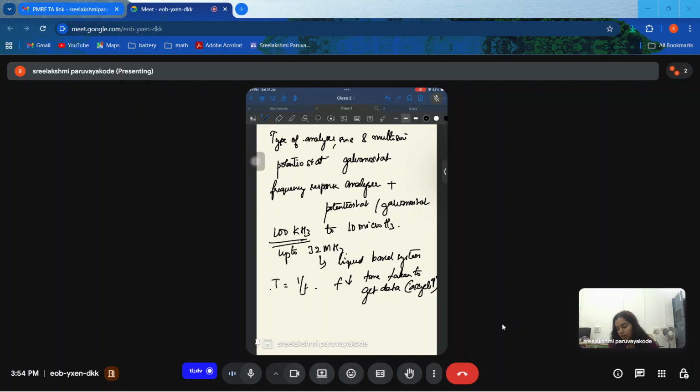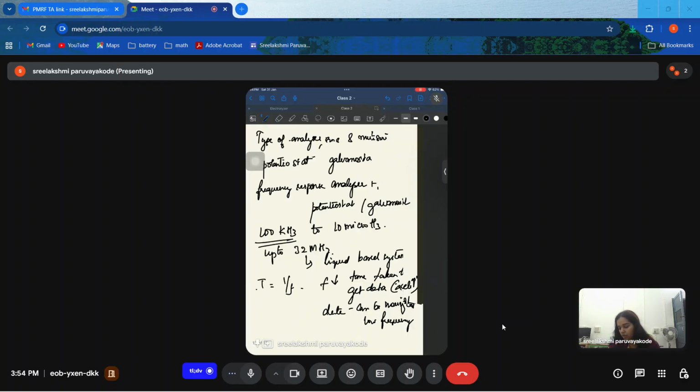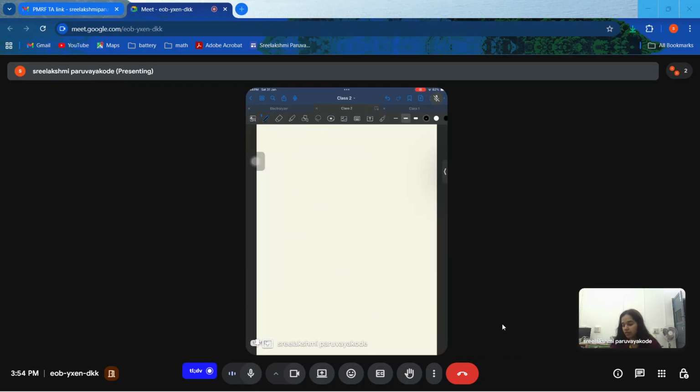Okay. And the problem is data can be noisy at low frequency, also because it's taking so much time. This is an overall introduction into this topic. Now let us see the types of analyzer.